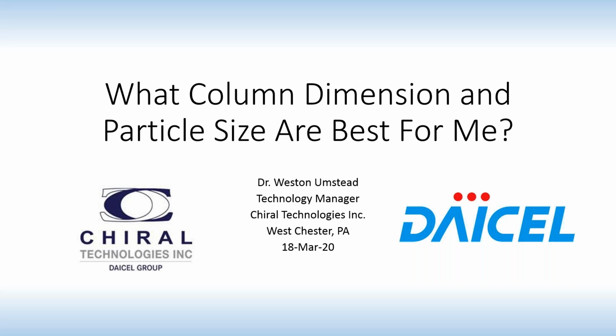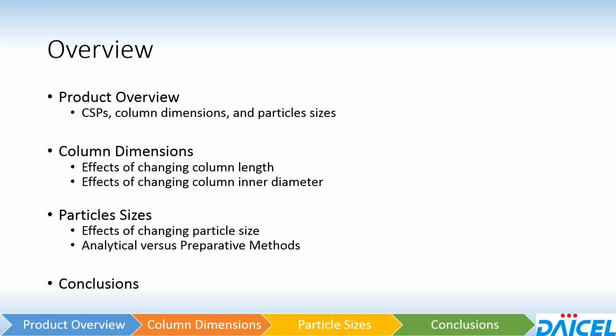All right, thank you very much, Tracy, and thank you again to everybody who is out there listening today. We appreciate you taking the time, given the uncertainty that we're all facing right now, to tune in and learn a little bit about what column dimension and particle size are best for me. This is a question that we often get asked by customers, both new and more advanced, especially when somebody is looking to begin starting a screening setup, for instance, and exactly how they should begin the process, what column dimension, particle size, etc. So that's going to be a focus today.